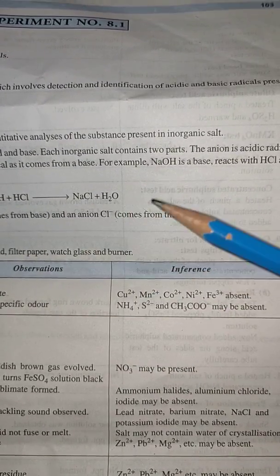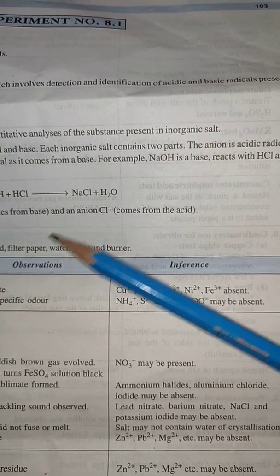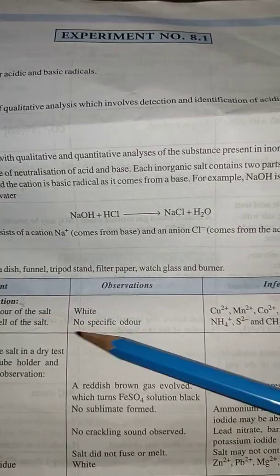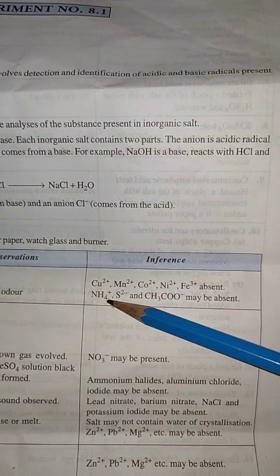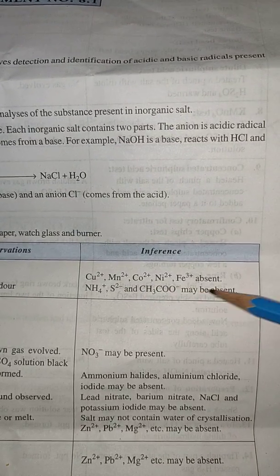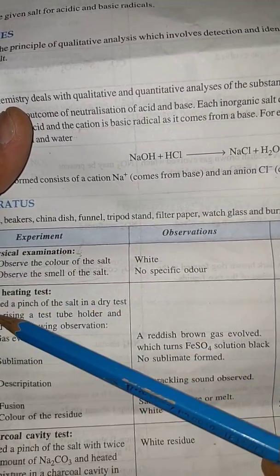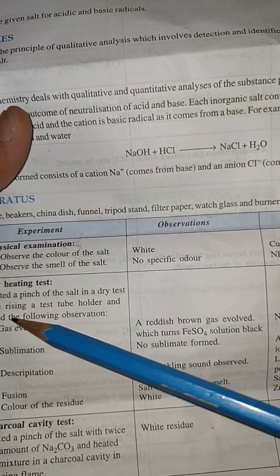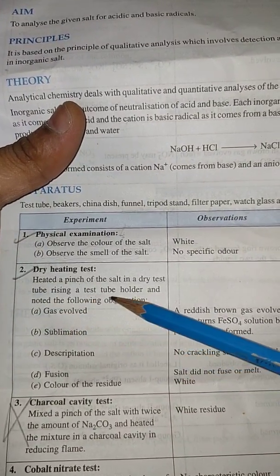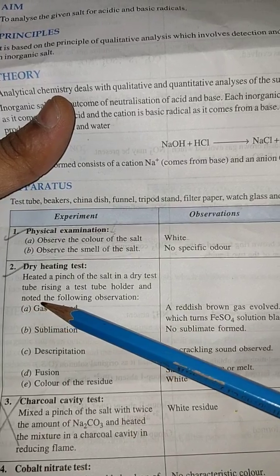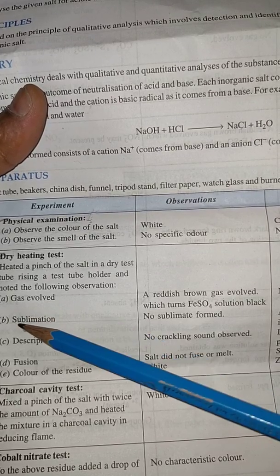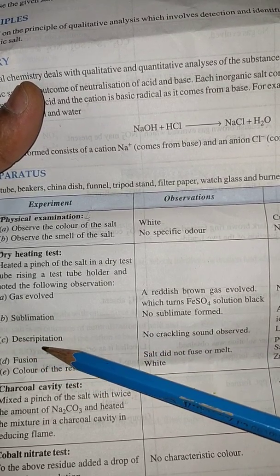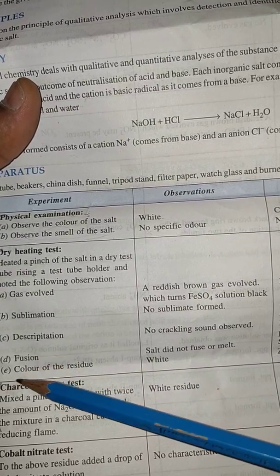Suppose we are getting a salt in which the smell is not specific like ammonia, like sulfide, like acetate, so these are absent. Now come to the dry heating test: heat a pinch of the salt in a dry test tube using a test tube holder and note the following observations: gas evolved, sublimation, decrepitation, and color of the residue.